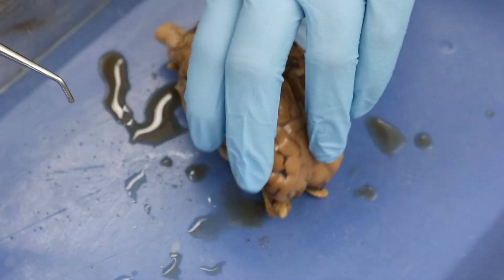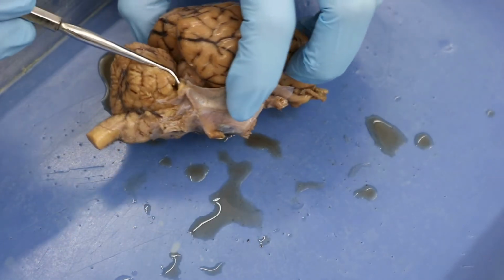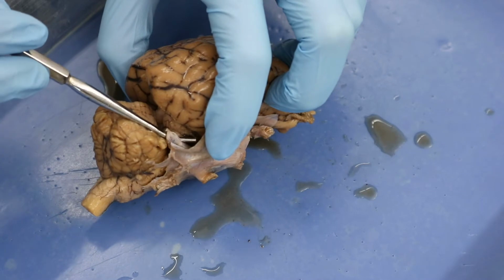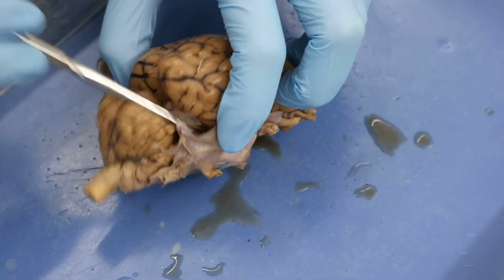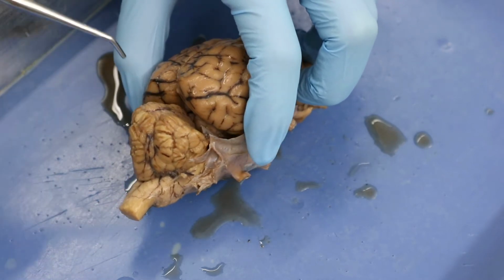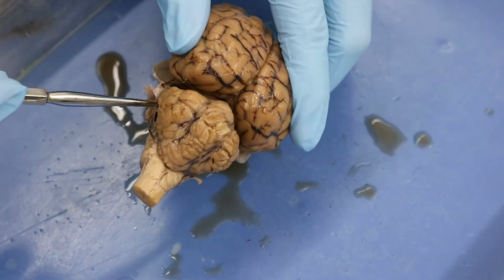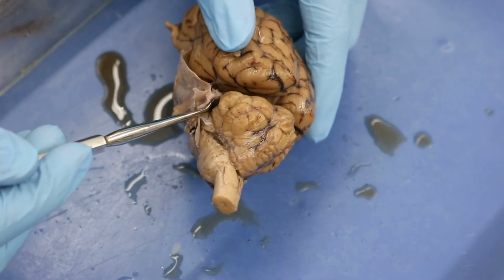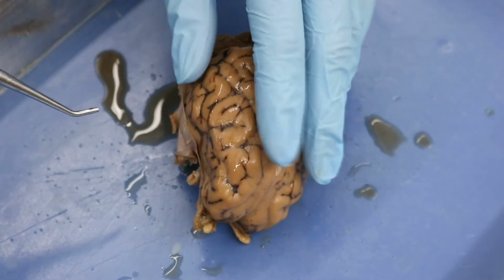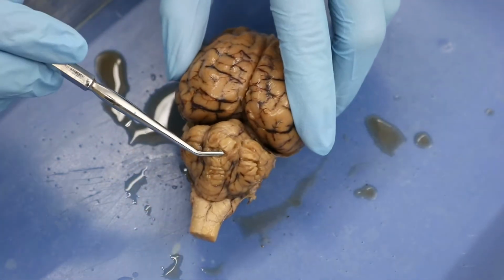Now, the other meningeal extension is right here. You can see there's this kind of triangular portion here that was in between the cerebellum here and the cerebrum here. And so that is your tentorium cerebelli. Most of it is cut off, but on both sides there's a little tiny triangle of it left that can be seen, okay? So that's your tentorium cerebelli. So, let's see, what's next on your list? We found all that. We've said this is the cerebellum.